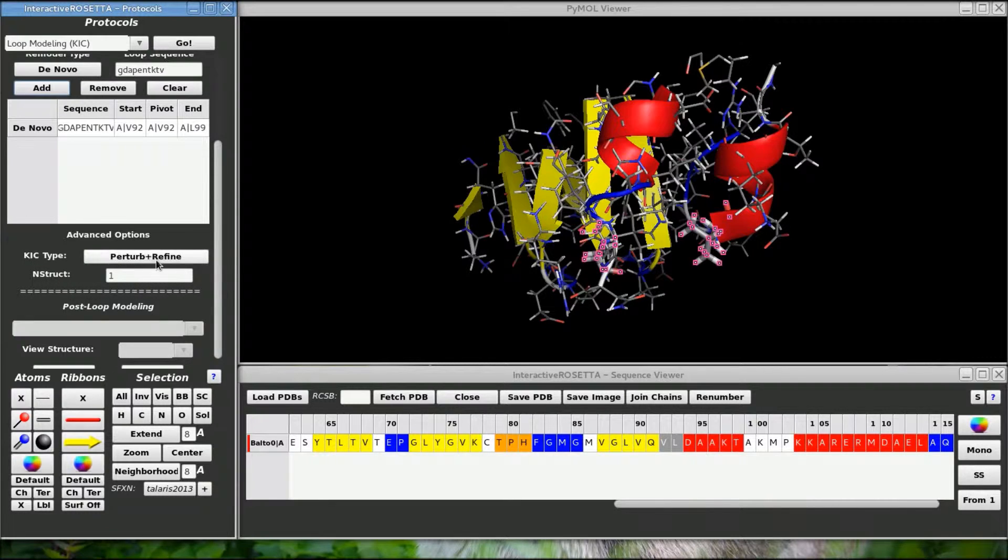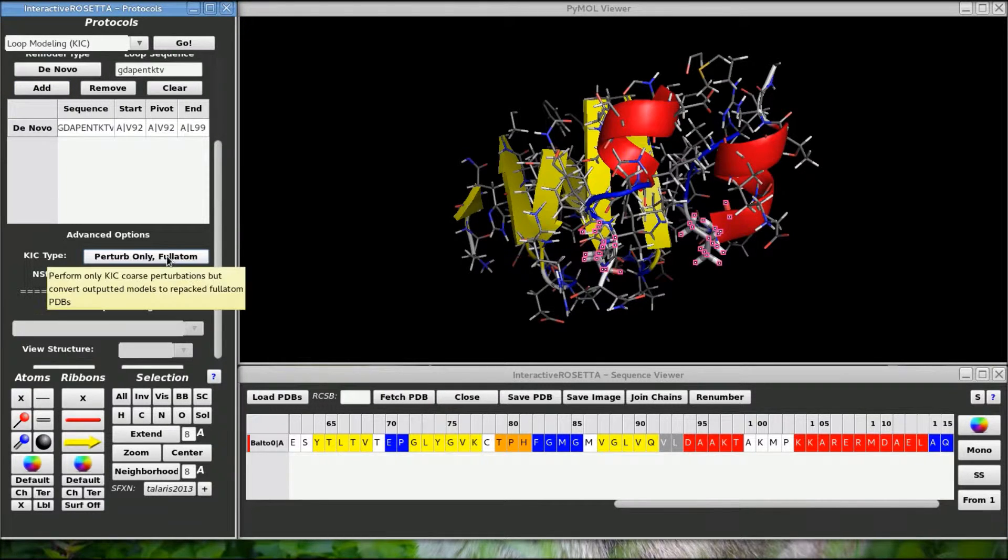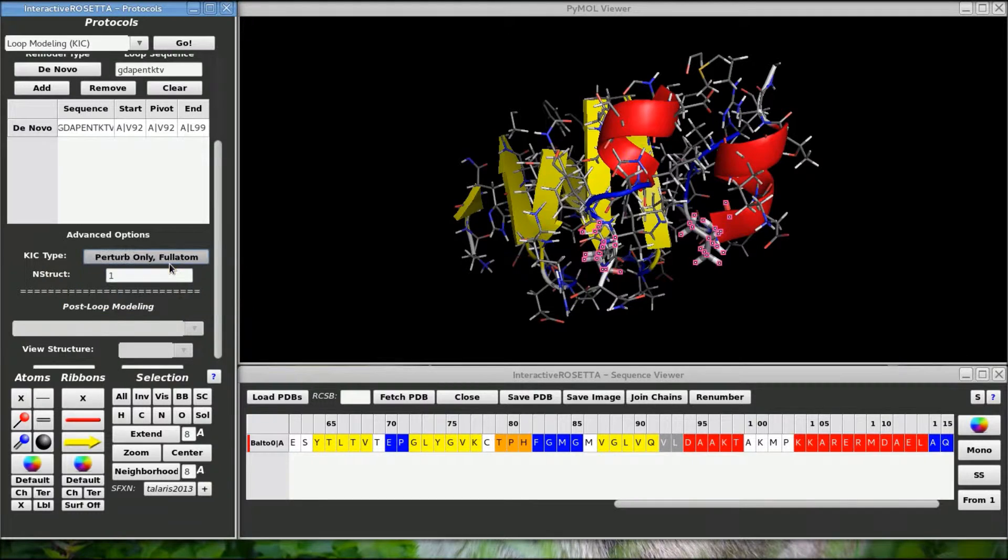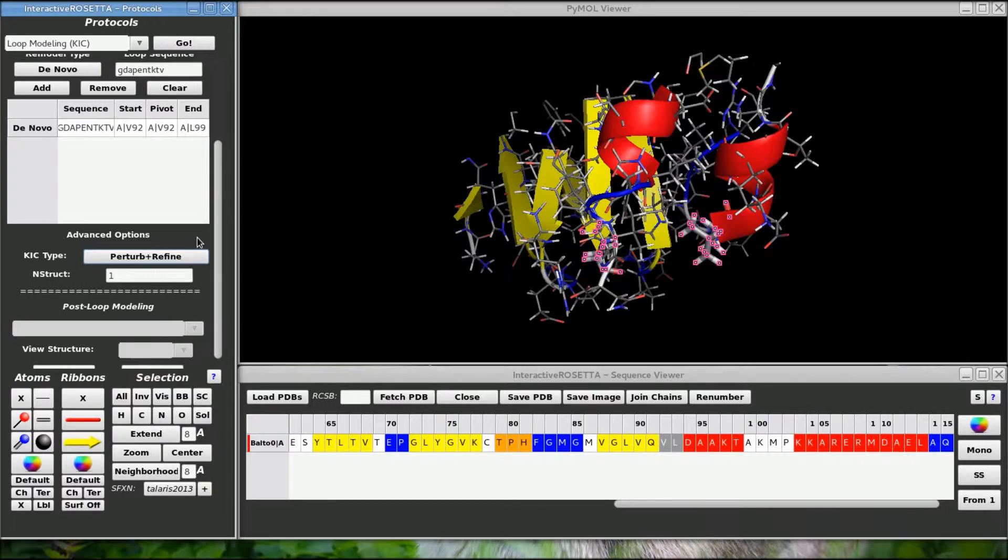There are some advanced options down here. This kick type button is only available if you are doing a reconstruction. You can tell the kick mover to only run the low resolution mode and convert back to full atom mode, but not perform the high resolution step. Some people were asking for this feature so I made it available.